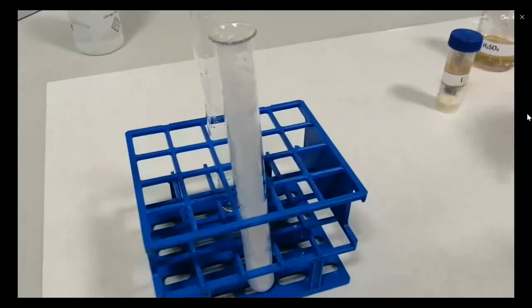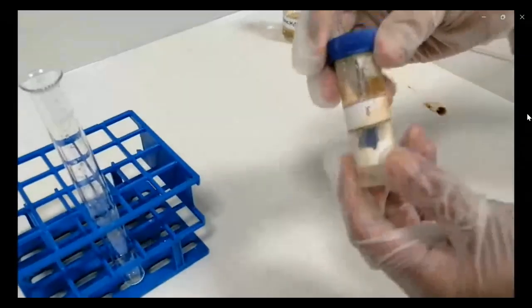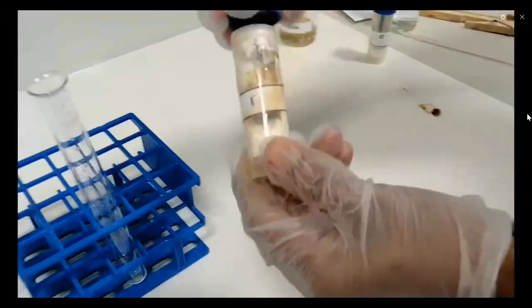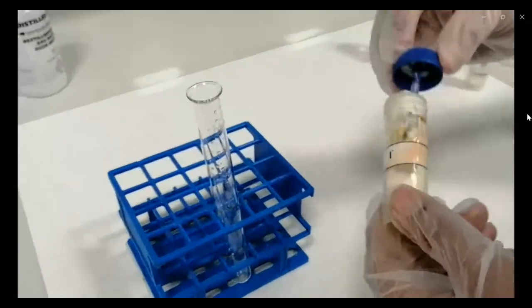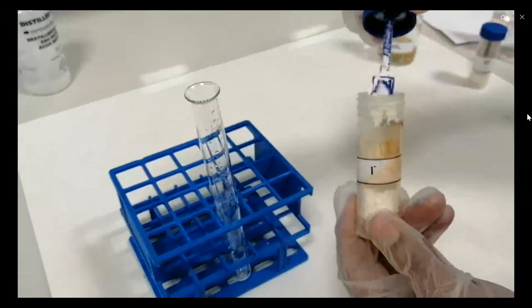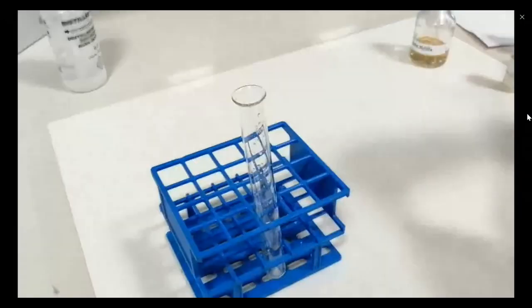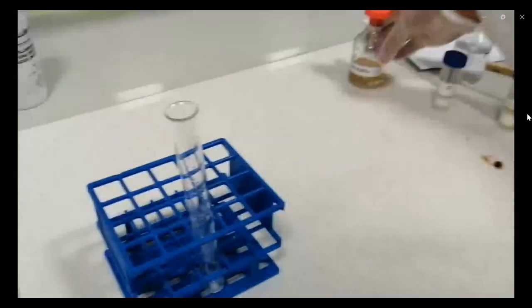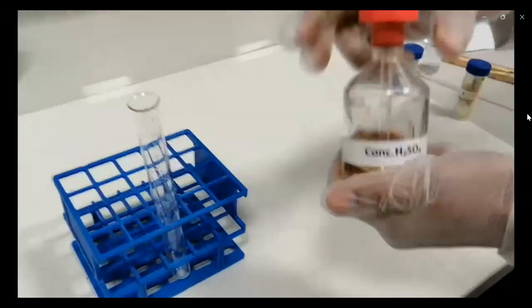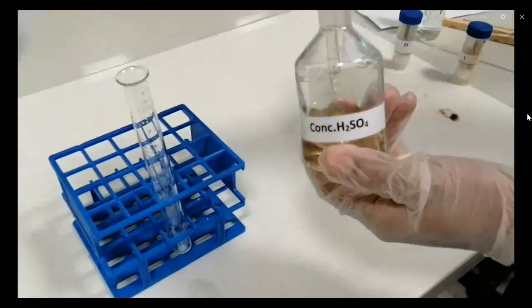In case of iodide, this is the primary test for iodide. You have to do it on the salt, and you have to differentiate between the primary test and the confirmation tests. For the primary test, you do it in the salt, in a dry and clean test tube, and just add the group reagent. You will see the observation corresponding to that analysis.